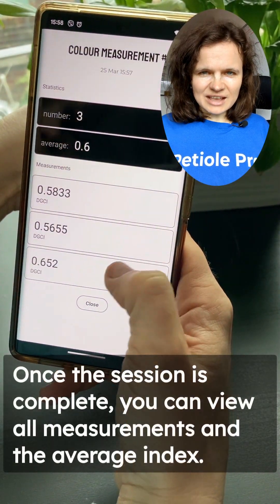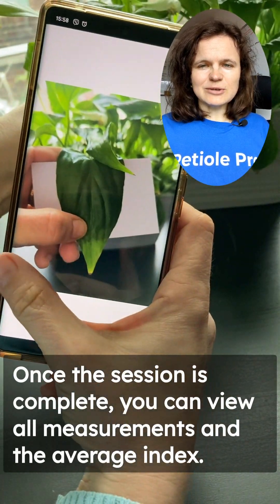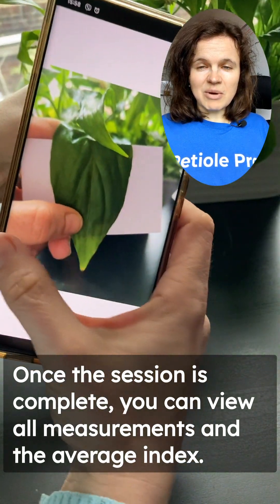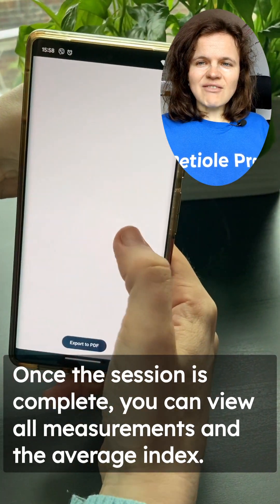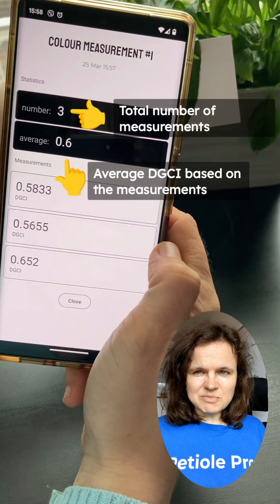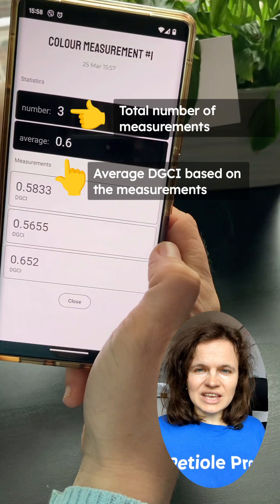Once you have taken all your measurements, the Petiole Pro will display the total number of measurements — in our case it's 3 — and the average DGCI value. You can also access each individual measurement and see the value of each DGCI measurement during the session.